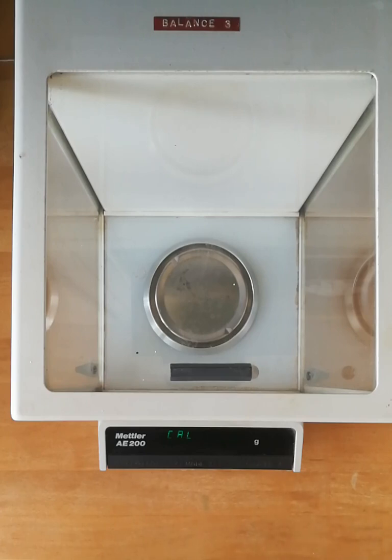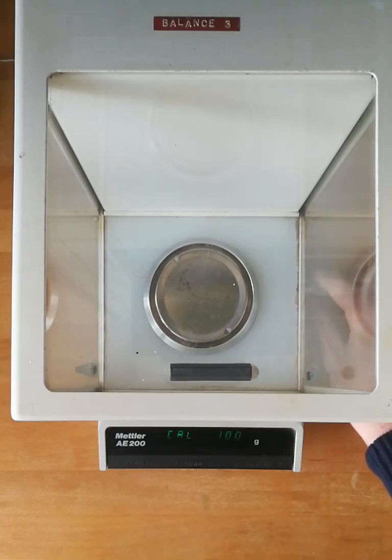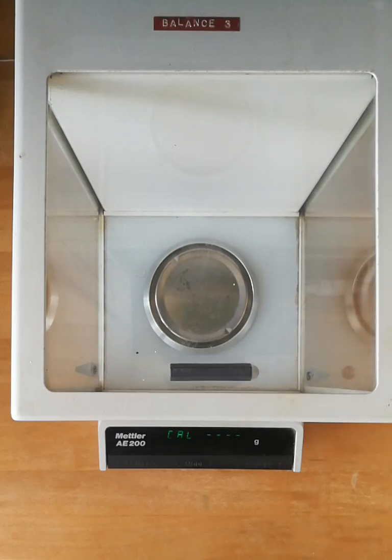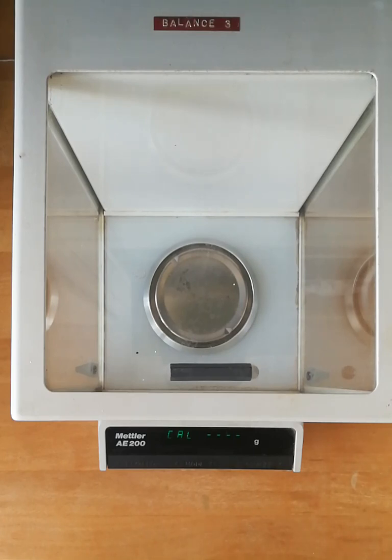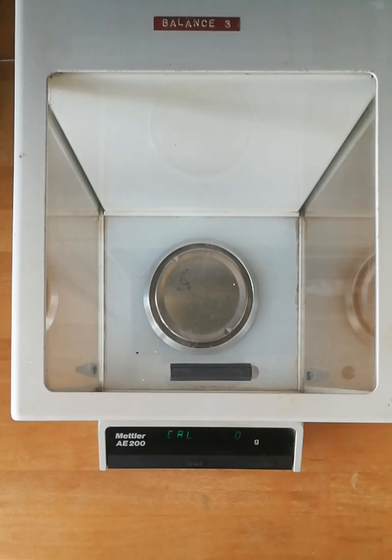Now it's requesting the hundred-gram weight. I'm going to take the calibration lever on the right-hand side and slide it from the forward position to the rear position. Now it's going to take that hundred-gram calibration reading, and the same again it will take up to several minutes to stabilize. Then you should see that it's taken that reading and given a hundred-gram exactly value.